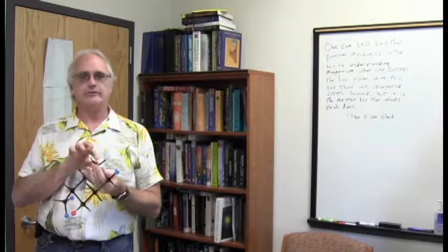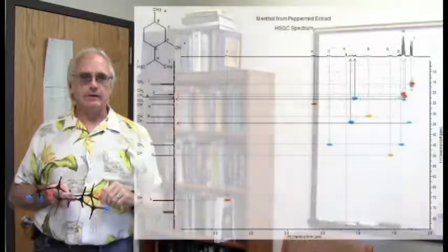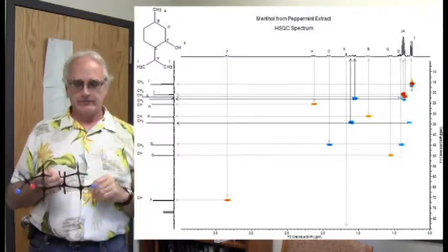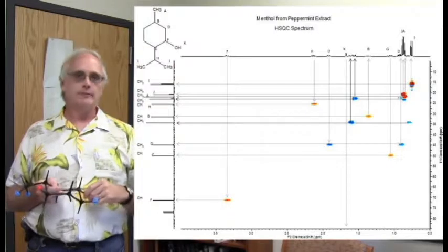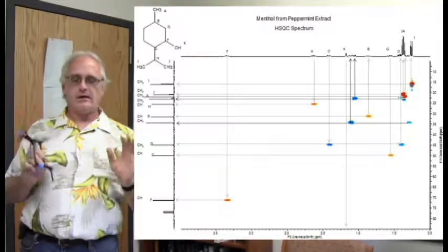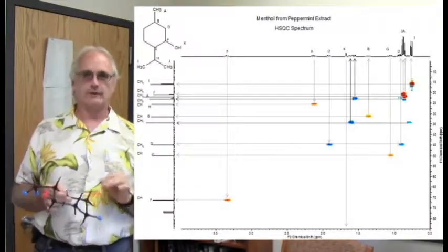We're down to position C and position E, the remaining CH2 groups. We see them both in the HSQC. We see very nicely they're there. We see that the two protons on each of them are different. Two of the protons seem to cluster just above 1 ppm. The other two seem to be clustered in that awful mess below, around 0.8 to 0.9, all piled up in that methyl group. It's just a terrible overlap in there.